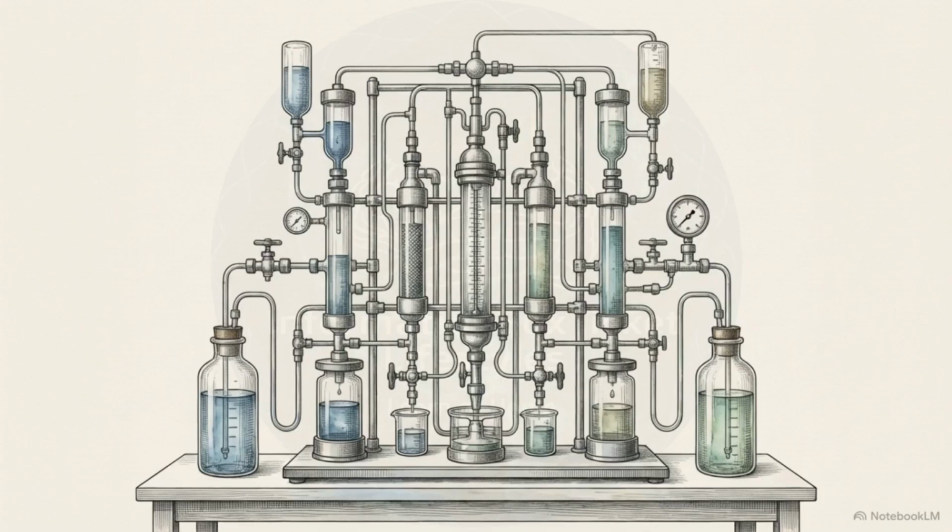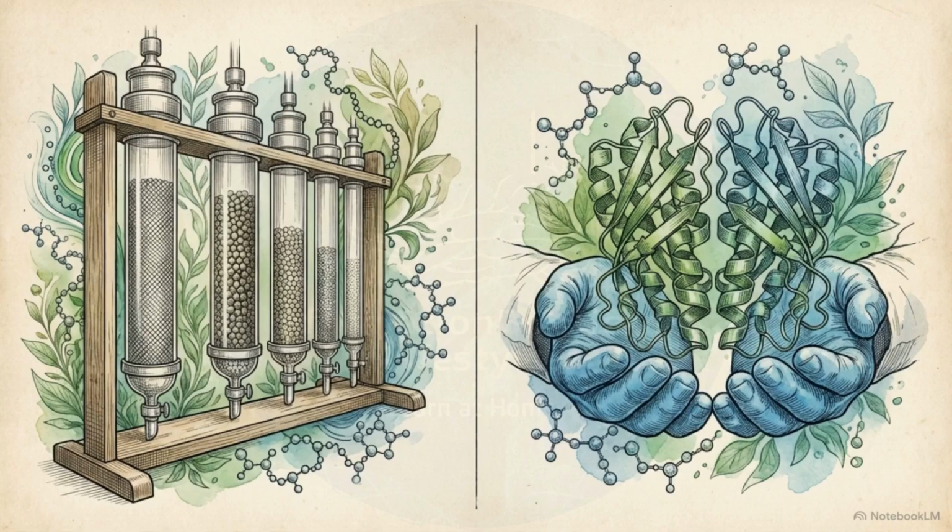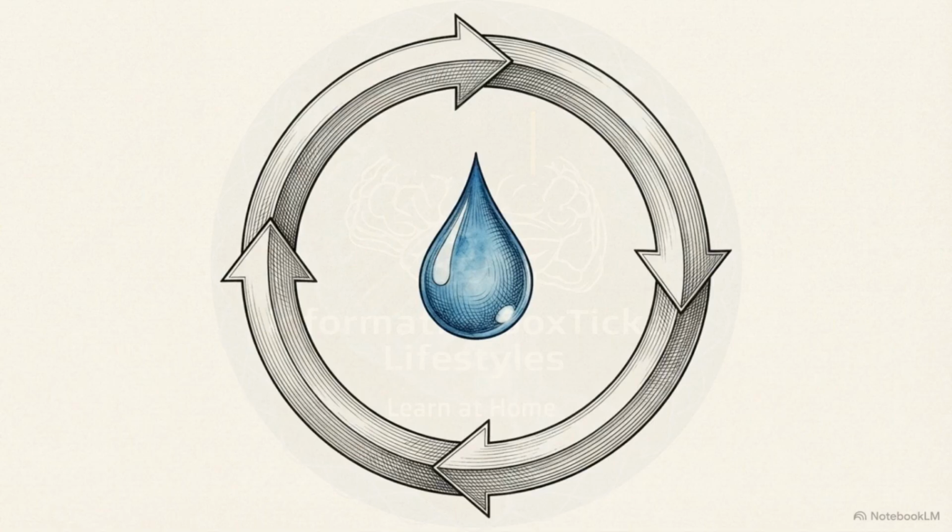In the 1980s, the industry developed Fast Protein Liquid Chromatography, or FPLC. FPLC is a liquid separation technique specifically engineered to operate at medium pressure, fast enough to be efficient for production, but gentle enough to keep delicate molecules intact. The system operates as a continuous automated loop.